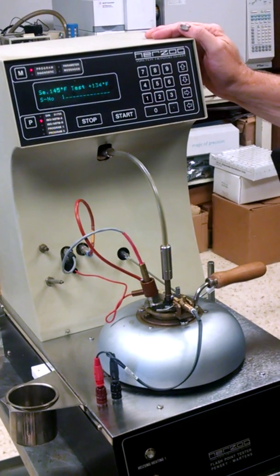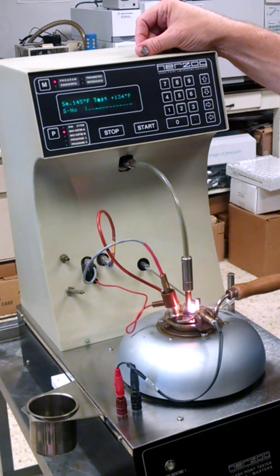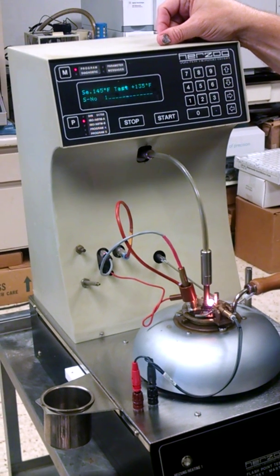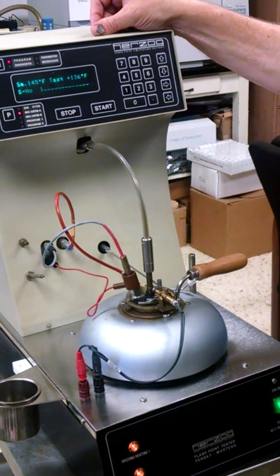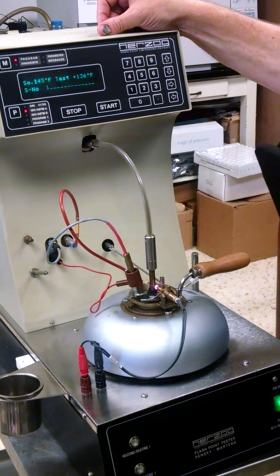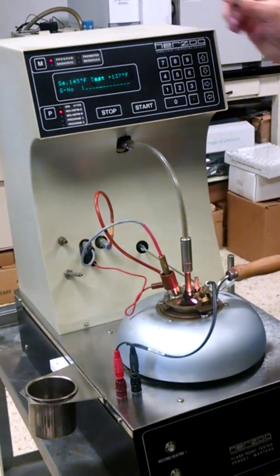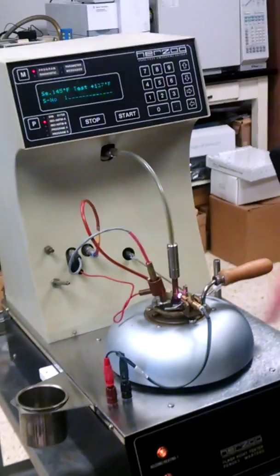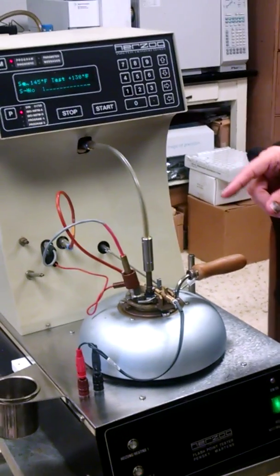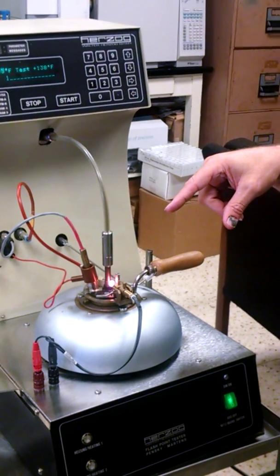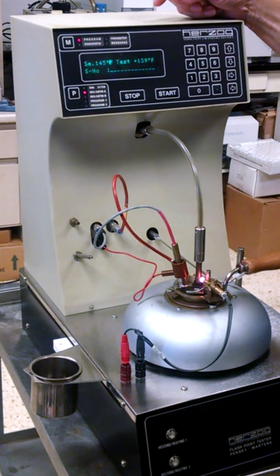This is a pretty stout machine. This will give you a lot of years of use. They're well built. Shouldn't have any problems with this machine at all. Probably the biggest problem I've seen with these if you run a lot of flashes is burning out the electric coil. Or if your lab hands are clumsy they'll break the probe. That happens a lot.